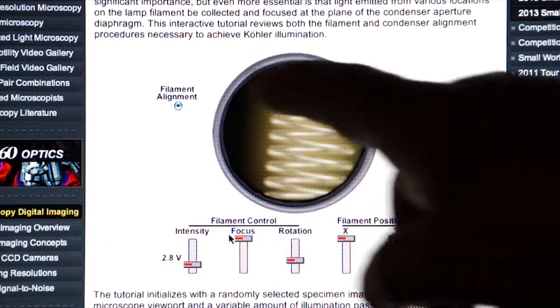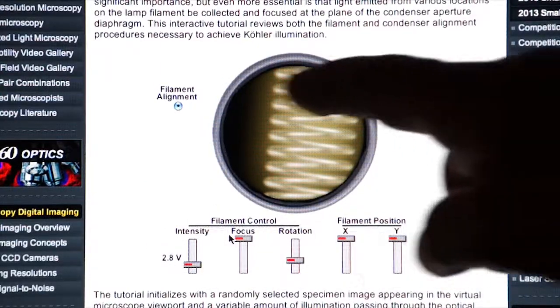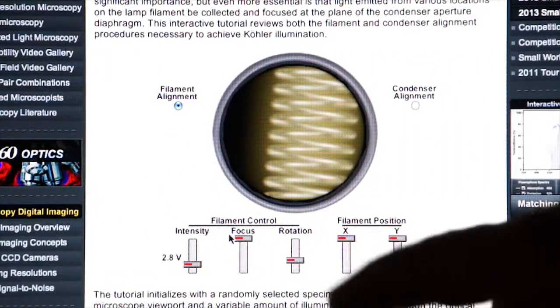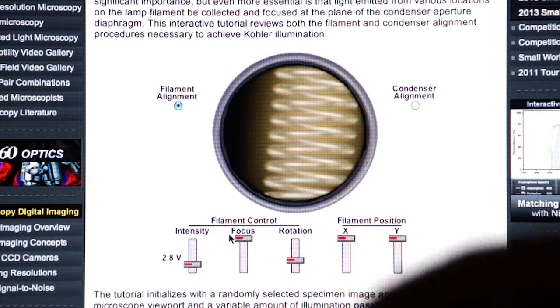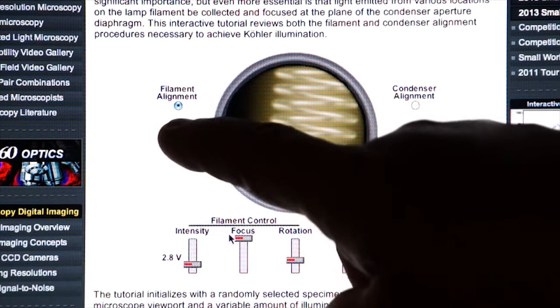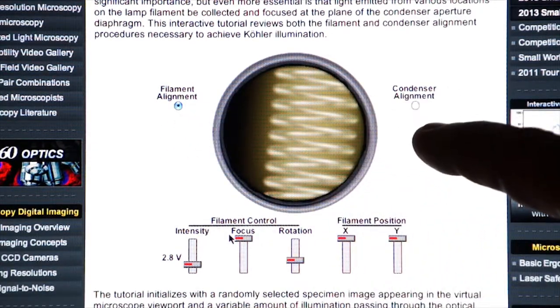Here on Nikon Microscopy U, we have a nice little tutorial under Köhler illumination that shows you both the filament alignment and the condenser alignment.